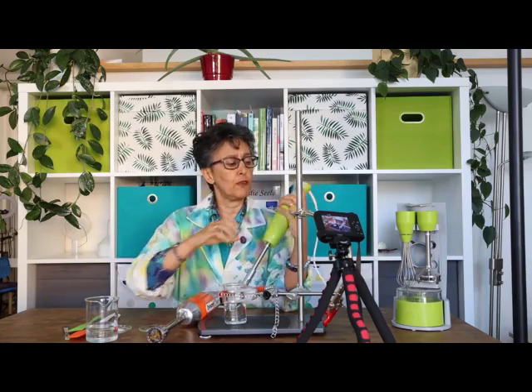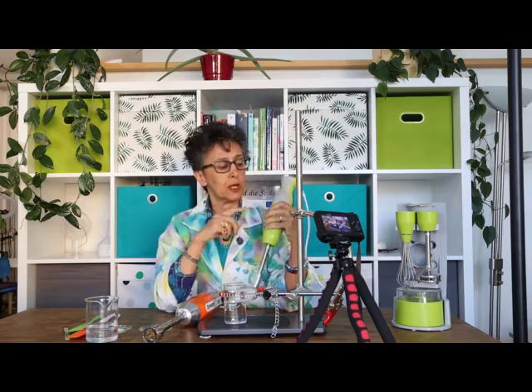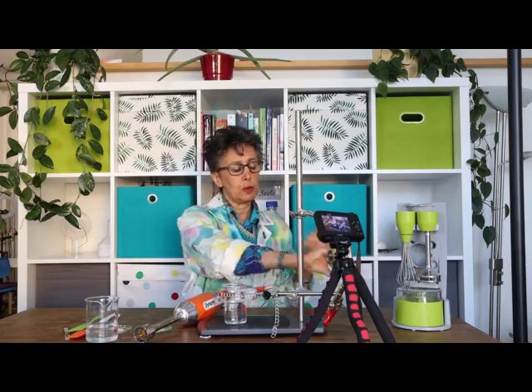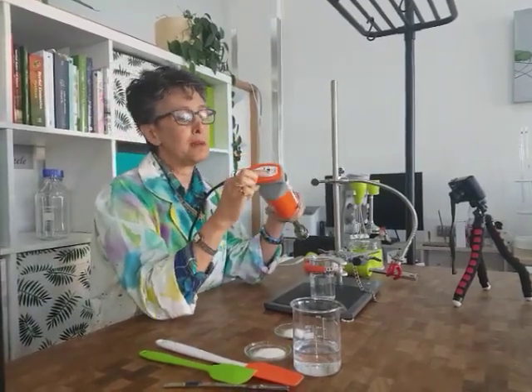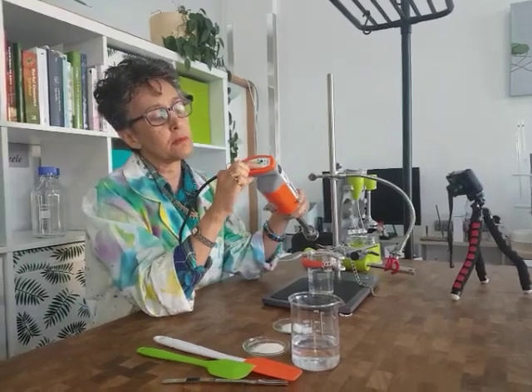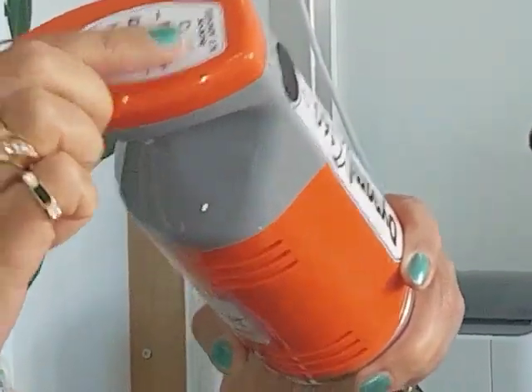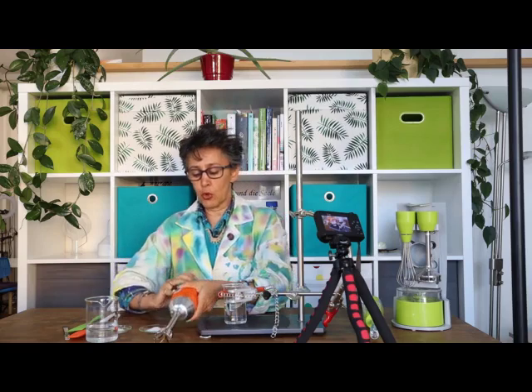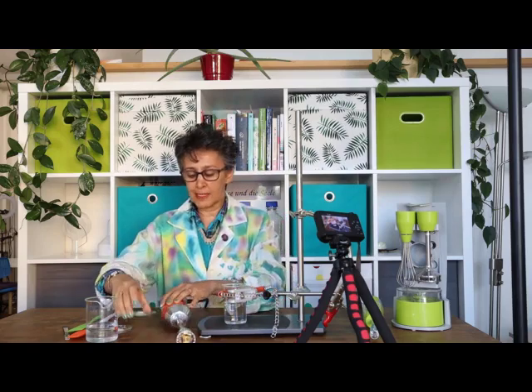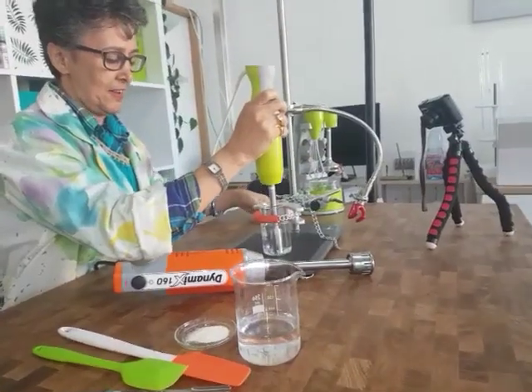With Kai Blendia you have only two possibilities to adjust the speed: a low speed and a high speed. With Dynamix you have the possibility to change the speed across six grades, so it's more manageable than Kai Blendia. Since I am right-handed it is possible that I block your view, but let's see how we can do the best.